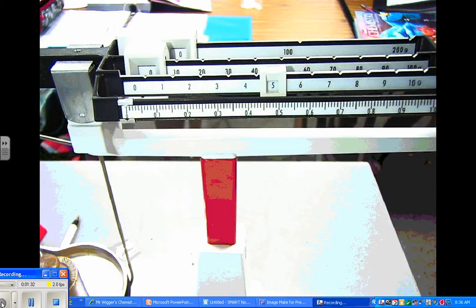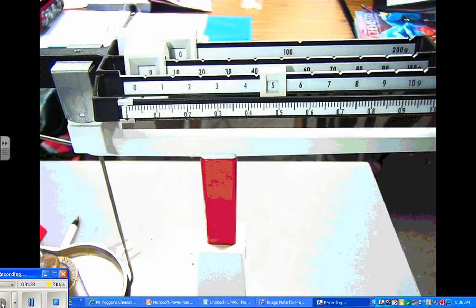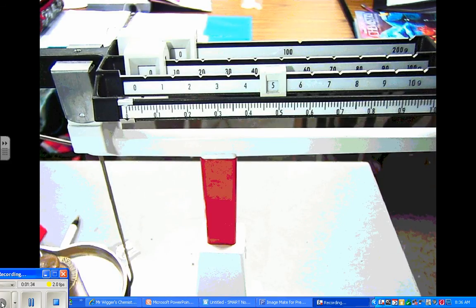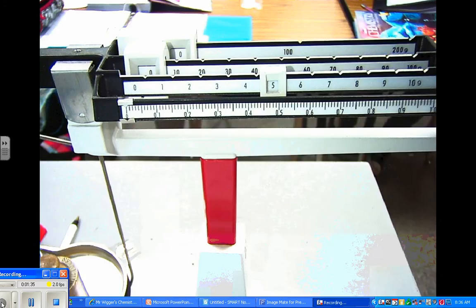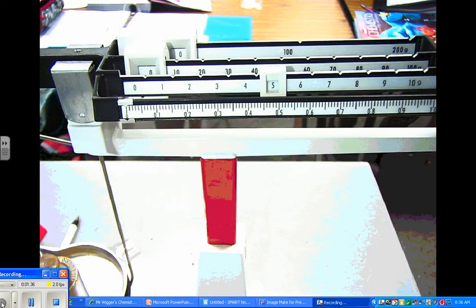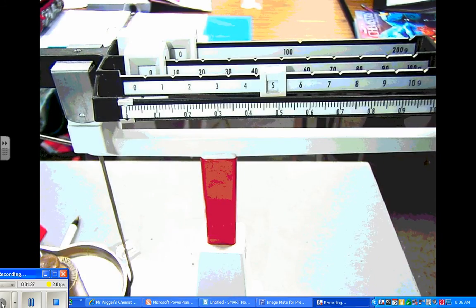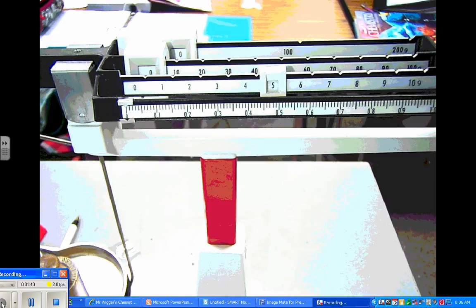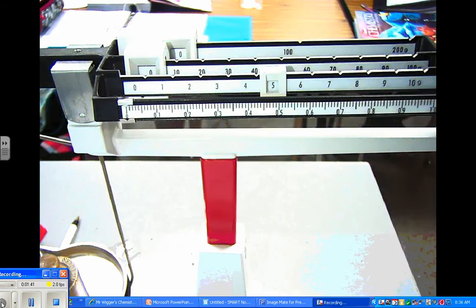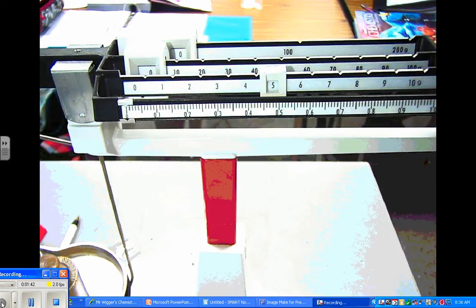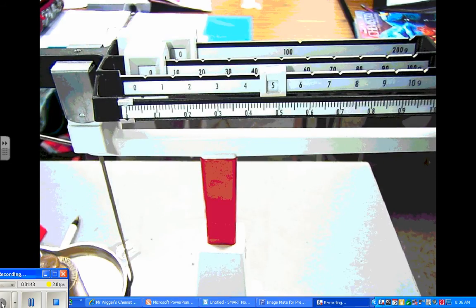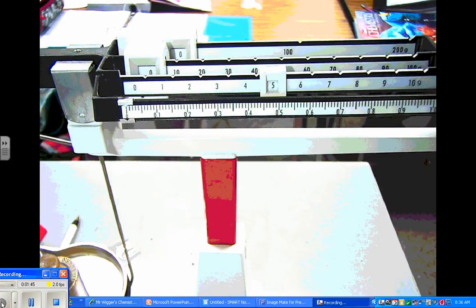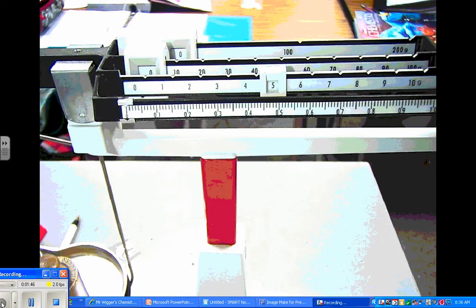Okay. So what is my mass right now? How would you read that? Five grams. Five grams, of course. That's easy.